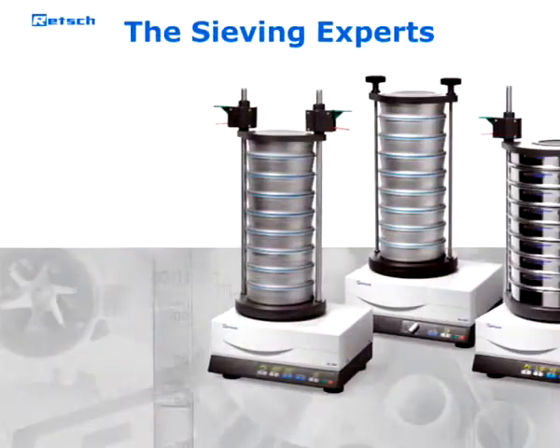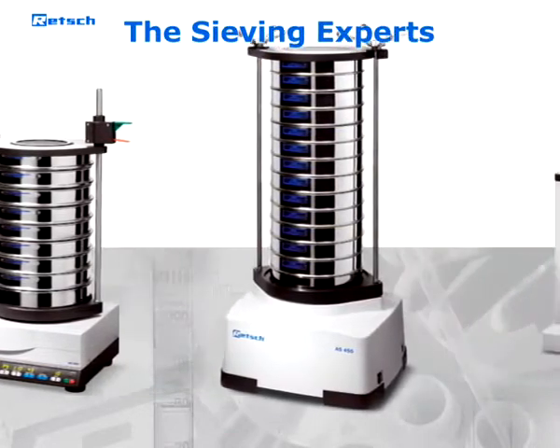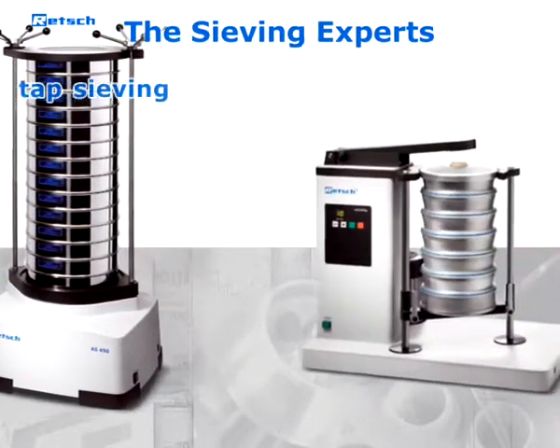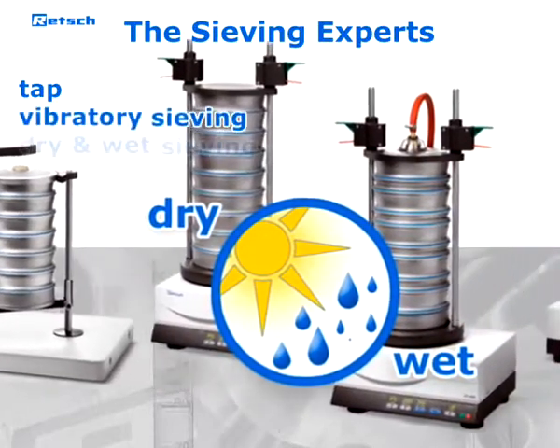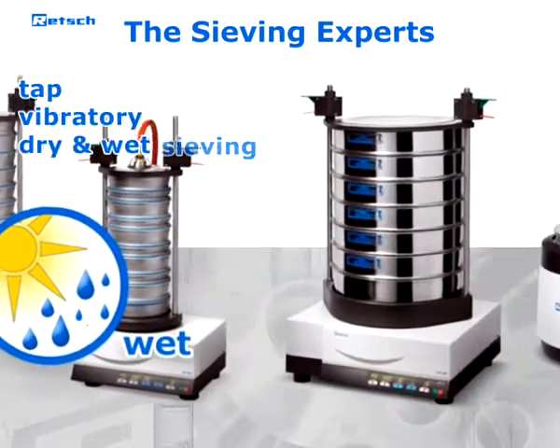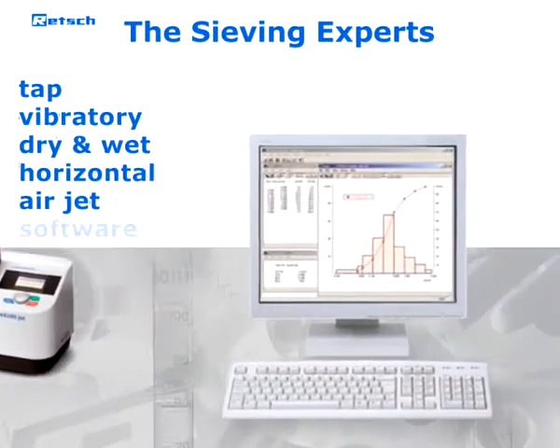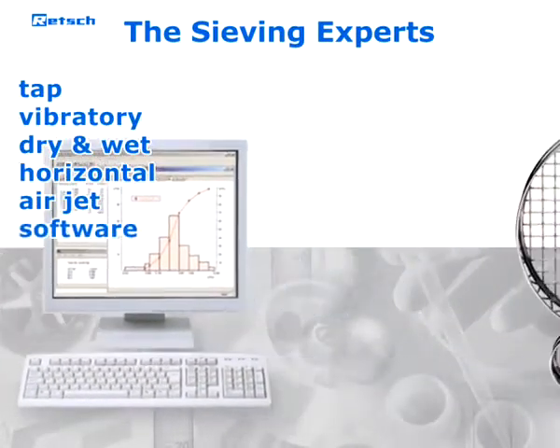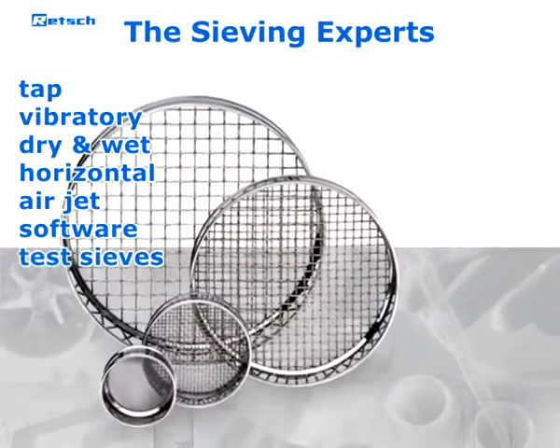As an expert for sieve analysis, Retsch offers the greatest product range in this segment. In addition to the AS200 TAP, the program also includes vibratory sieve shakers for dry and wet sieving, as well as instruments for horizontal and airjet sieving. The EasySieve software for automated evaluation of sieving results and the high-quality test sieves complete the line of products.